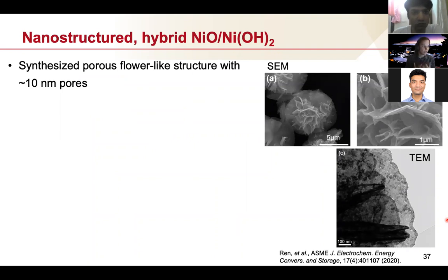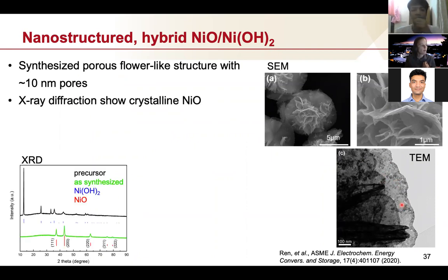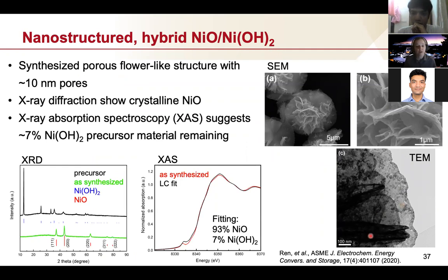It has 10 nanometer pores. You can see the SEM images, they're beautiful. There are TEM images, you can actually start to see the pore structure. It shows that it is crystalline nickel oxide, but if we did spectroscopy, we found that it was not pure nickel oxide, but has a small percentage of nickel hydroxide, which is the precursor material.